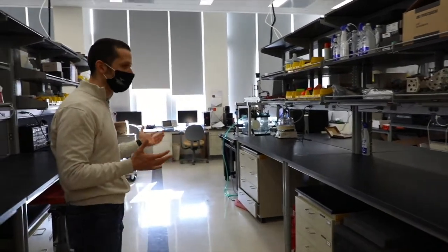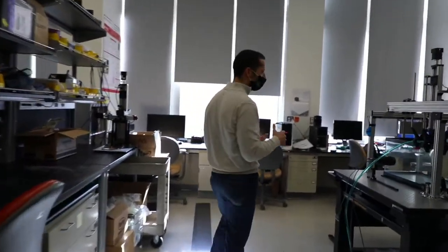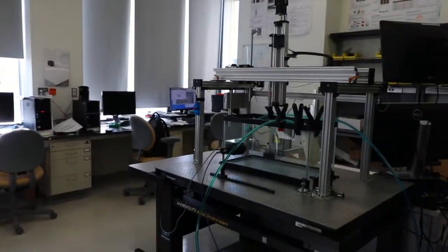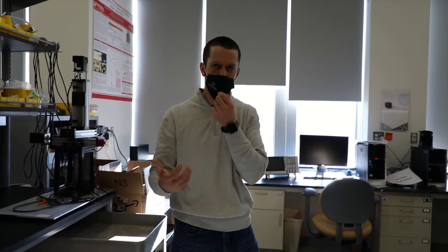I can kind of walk you through the rest of the lab. It's very similar benchtop setup. This is more of our in vitro work that we have wet lab space, benchtop. If you look to the left here, so electronics equipment. So a lot of device prototyping. So we make everything in-house, including the electronic driving systems, amplifiers, our focused ultrasound transducers themselves. In our other lab at our animal experiments, we have more of like a robotic micropositioner that's closer to the clinical setup that will eventually be used.